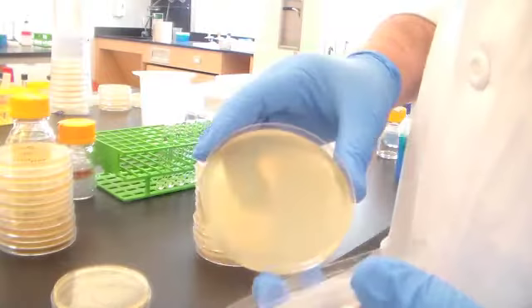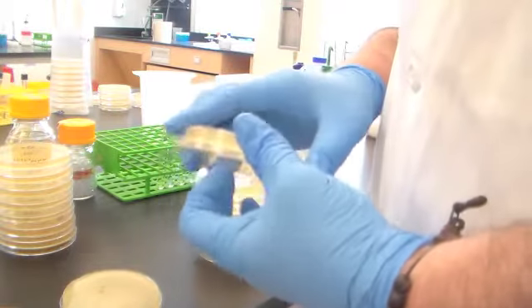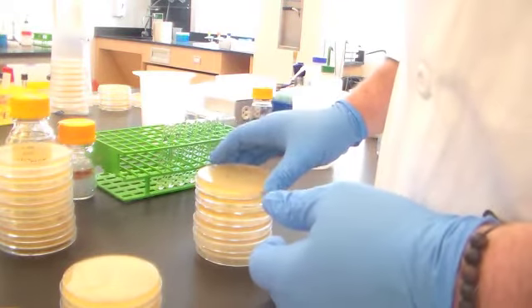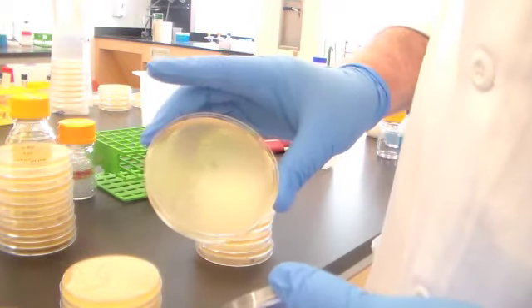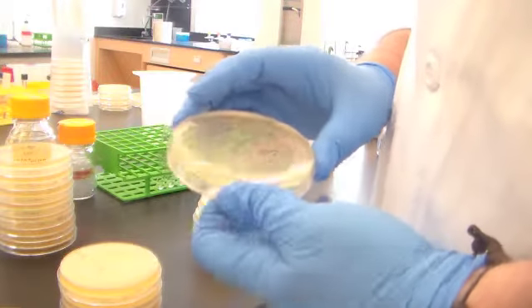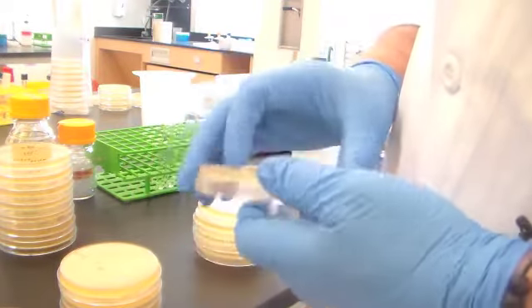At 10 to the minus 1, it's practically a lawn. Many too many colonies to count. As a matter of fact, the colonies are touching one another. Here's the 1 to 100 dilution of the culture that I did yesterday, and again, the colonies are touching one another, too numerous to count, TNTC. At the 1 to 1,000 dilution, you can see that there are fewer colonies, but there's still way too many to count. Once we get out to 10 to the minus 4, now you can see individual colonies, but still, I wouldn't even make the TAs count that number of bacteria.